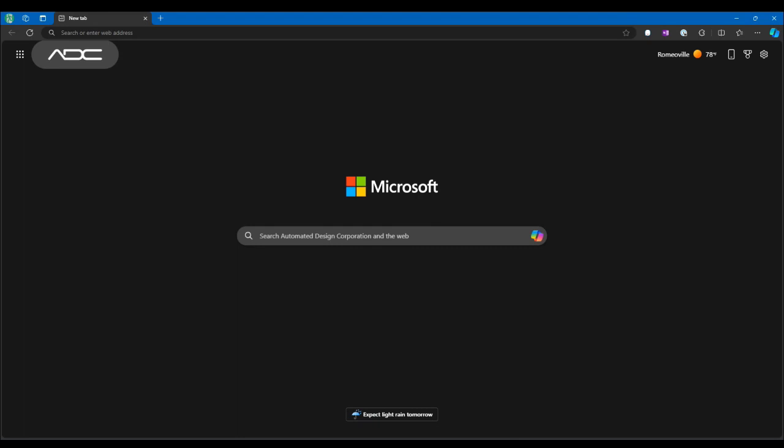This is a quick tour of MechLab 6.5, which is used to control the Gen 6 and other compression systems and load frames from ADC.